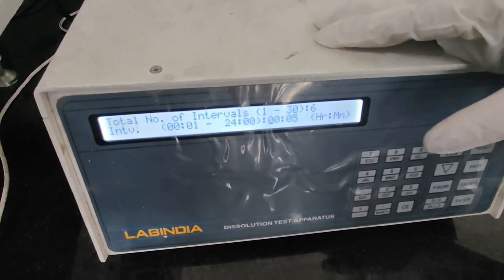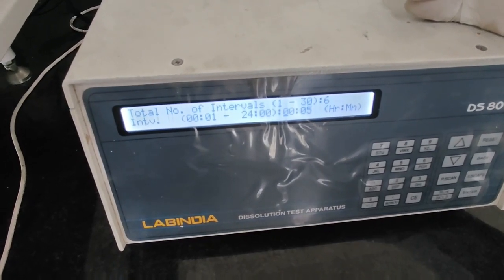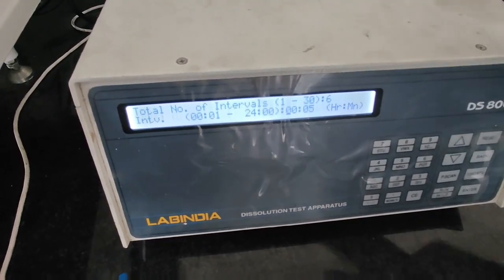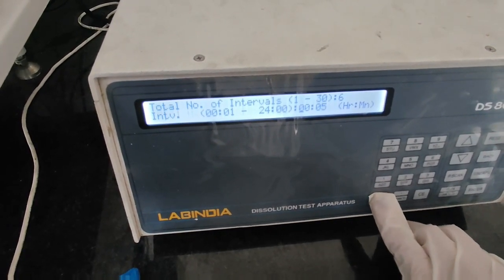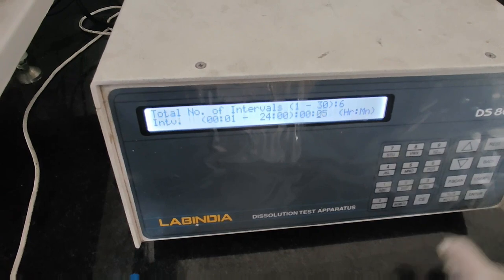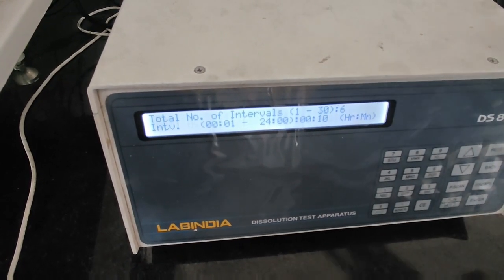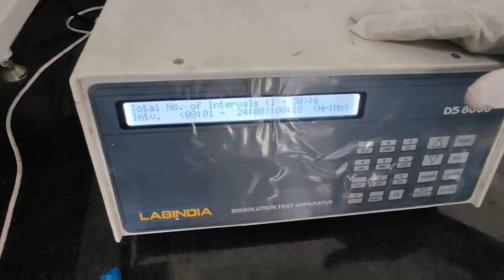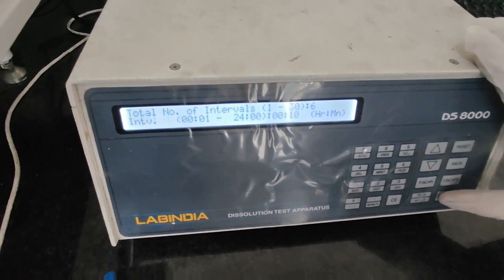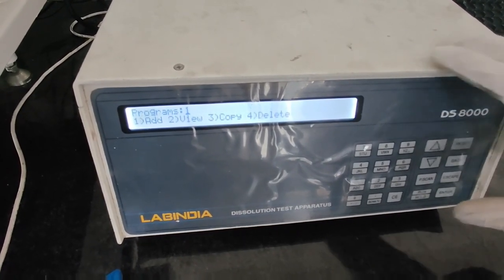Then interval time. I want to take readings after every 5 minutes. It is already 5, but I will show you how to change it. For example, I have selected 10 minutes. Again enter, then 1 and 0. Now it is after every 10 minutes, you will hear a beep sound and you have to take the sample. Then press enter. Recovery test, I don't require that. Press enter.